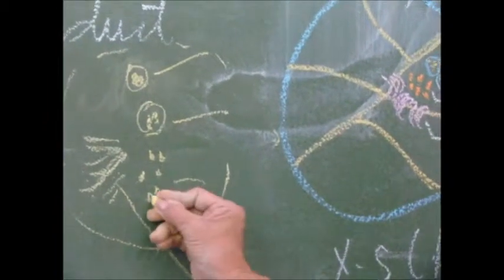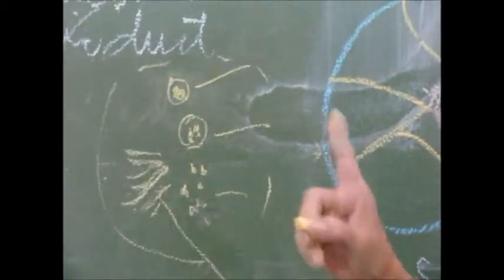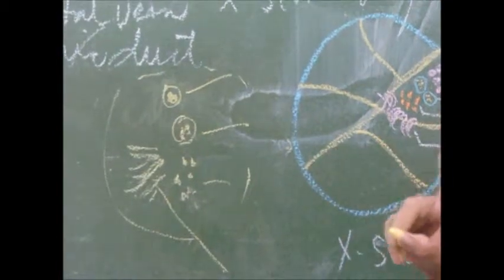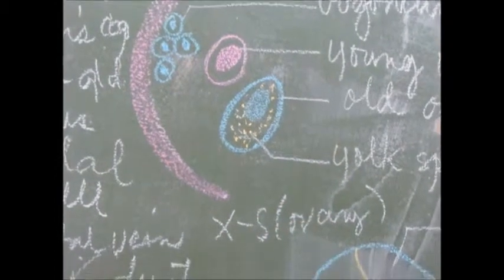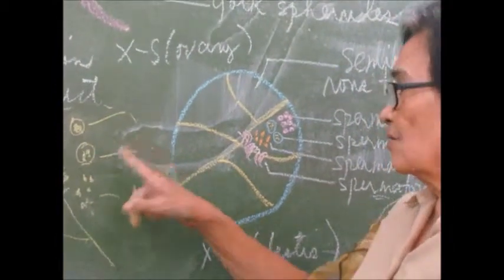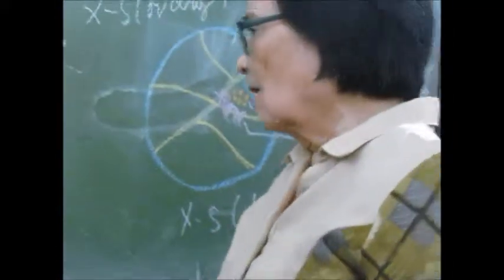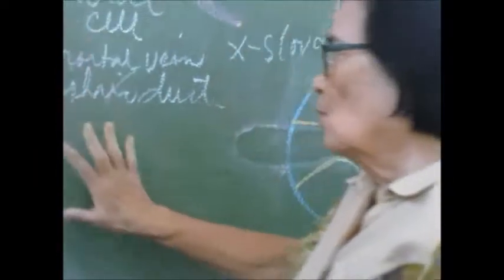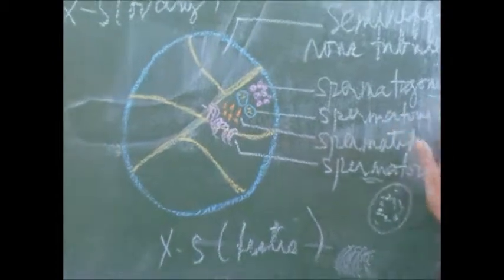Okay? Now, they have already a tail or a flagellum because the sperm cells are capable of movement, whereas female germ cells cannot effect movement. So this is what you are going to identify. You only take note of the size of the cells. Okay? And these are all focused under the microscope. Okay, so you start with the digestive, so that you will not group all at the same time. Then some of you work on the urogenital and the others on the digestive. So you can have this.